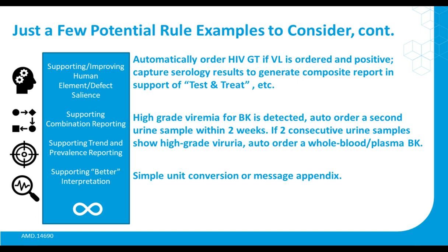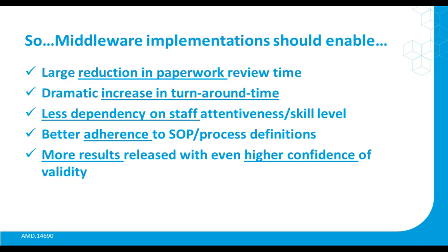So those are just a few of the items I wanted to talk about. It really is limited. Talking to any one of your commercial vendors who have middleware solutions will give you many more ideas. The implementations really, when they're done correctly, should result in a dramatic reduction in paperwork and the review time that we all normally do. It should dramatically increase your turnaround time.